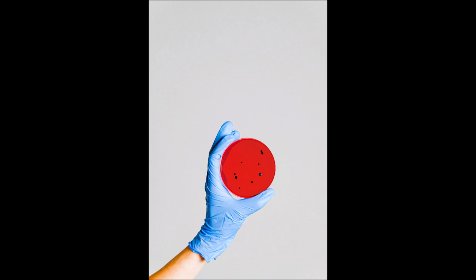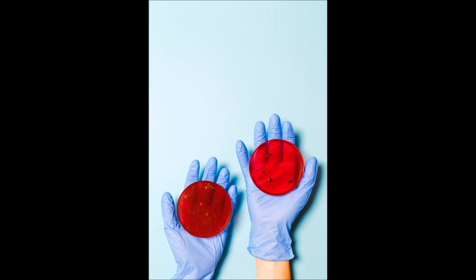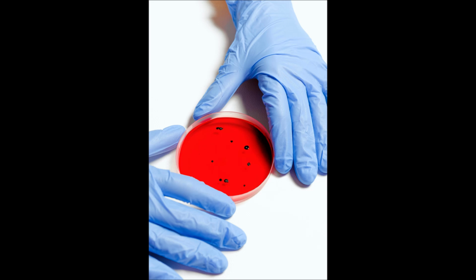Physical separation techniques were also used, like centrifugation and filtration, but they were often limited in efficiency. Identification also heavily relied on Gram staining and biochemical reactions. But now we have things like fluorescence-activated cell sorting, FACS, which uses fluorescent markers to separate microbial populations based on specific traits.